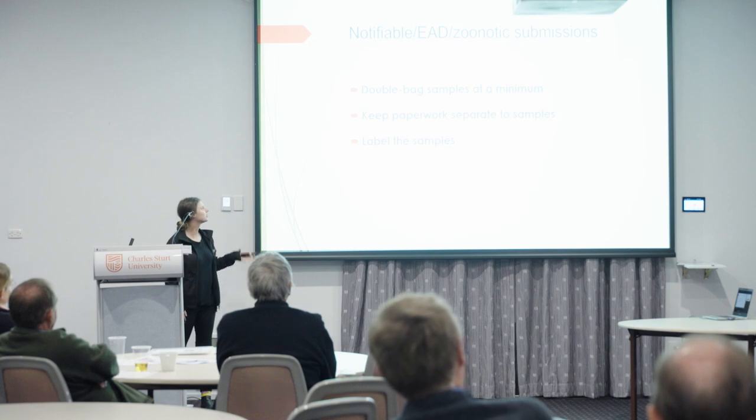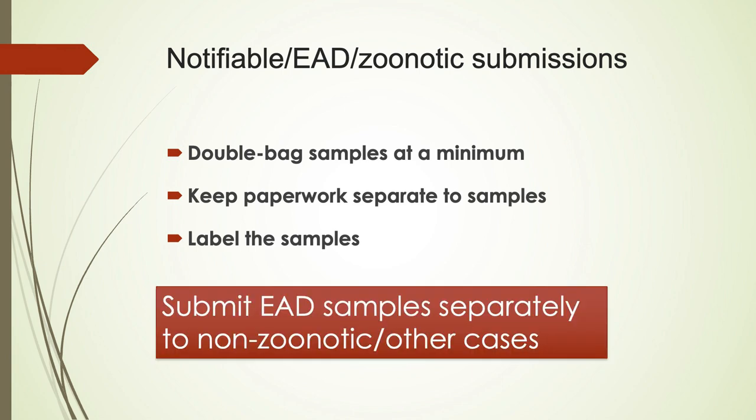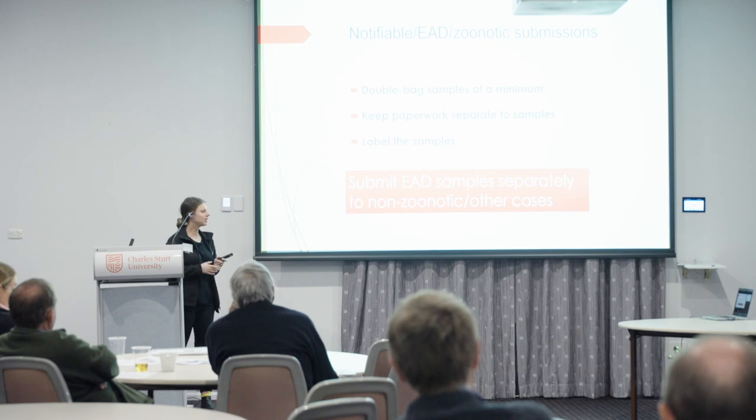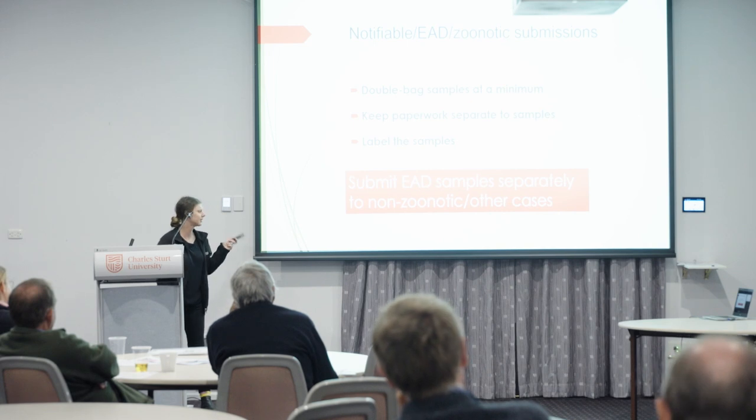For notifiable and zoonotic submissions, double-bag your samples at a minimum so that if something does happen it's contained. Keep your paperwork separate and label the samples. Also, submit your EAD samples separately from your non-zoonotic cases, because we treat EAD samples differently in the lab. Everything in that box will have to wait until the EAD is excluded before other testing can happen. So if you have a faecal egg count, put it in a different box so we can get those results back to you quicker.